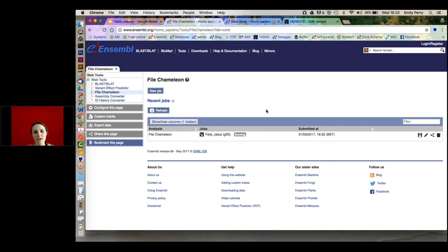You can see there's a bit of a theme — all of our tools work through a fairly unified interface. Once you're familiar with one of the tools, you should be able to use another; it's just a case of knowing what they do.